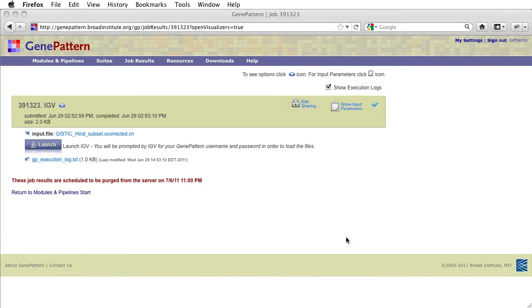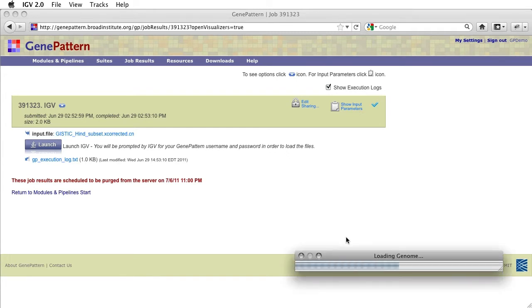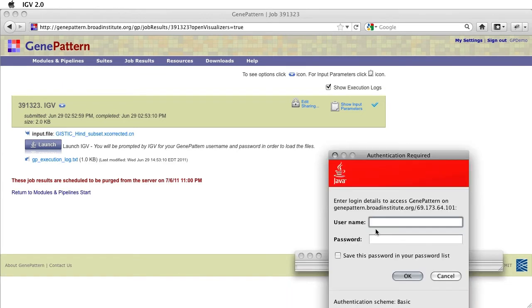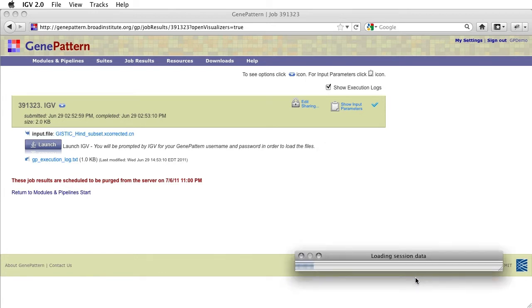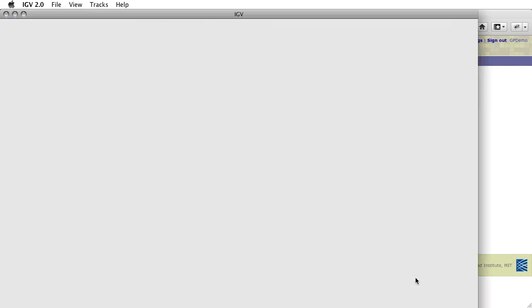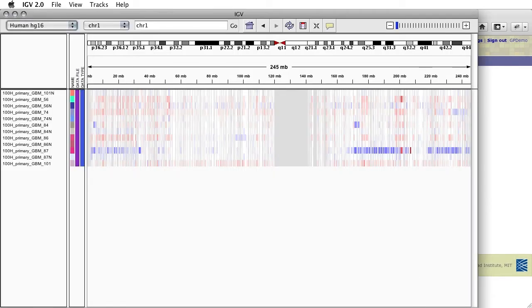As indicated on the job status page, you will now be prompted to provide your username and password so that IGV can access your data on the GenePattern server. You may also choose to save this password so as to avoid having to manually enter it in the future. As we selected, IGV launched with HG16 loaded and by default displays chromosome 1.